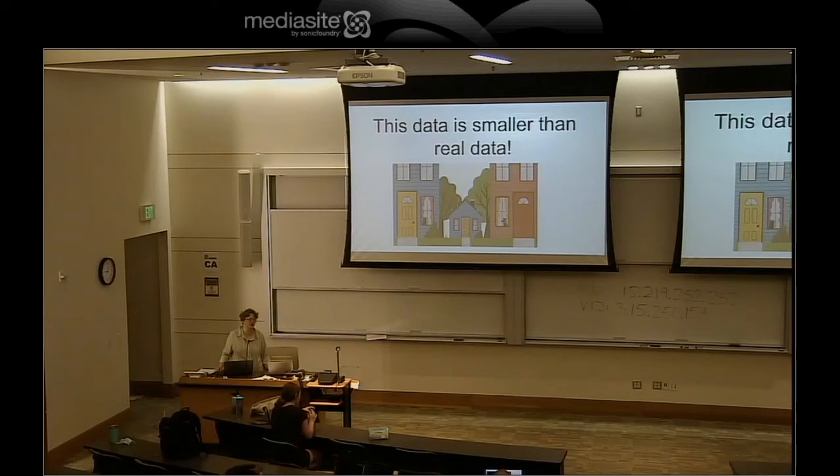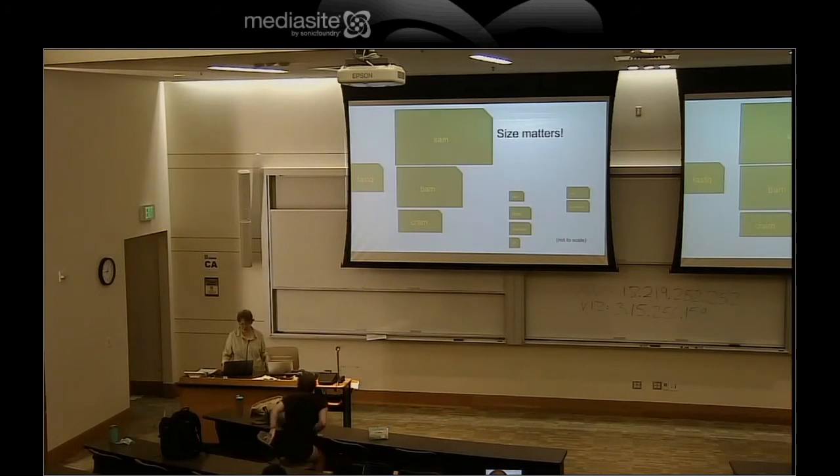A lot of what we're going to be doing is in RStudio, which we've had you install on your computer. When files get small enough, it is easier to work on your computer than the supercomputer. But before you start, you don't actually have an idea of how big the data you're dealing with is and which files are small versus not. So this is not to scale, but it gives you a general idea.